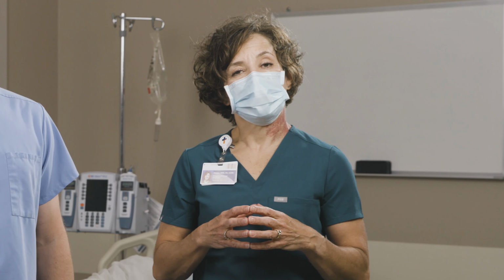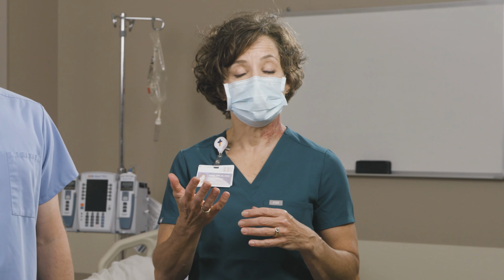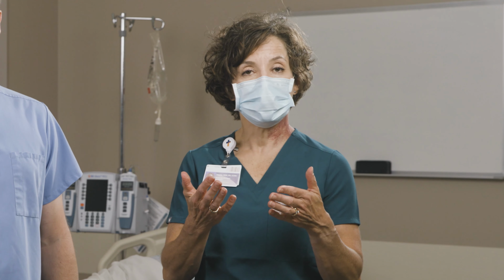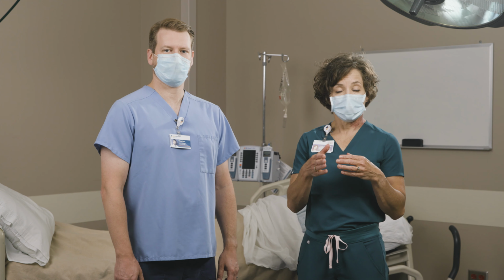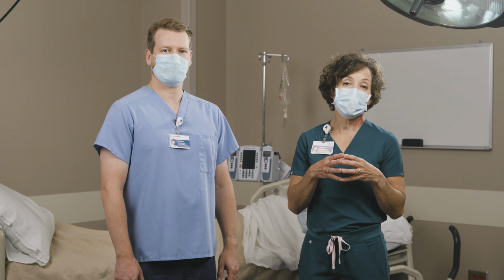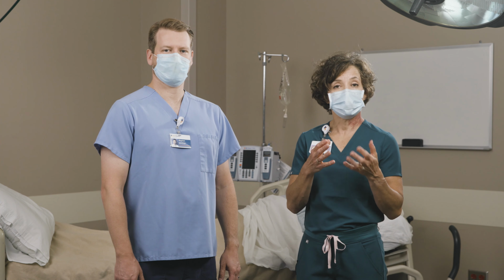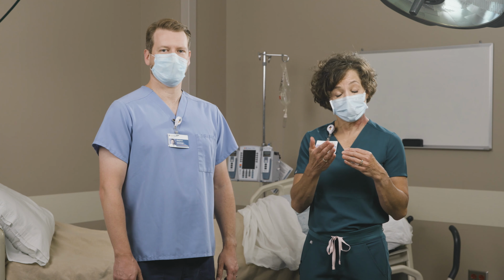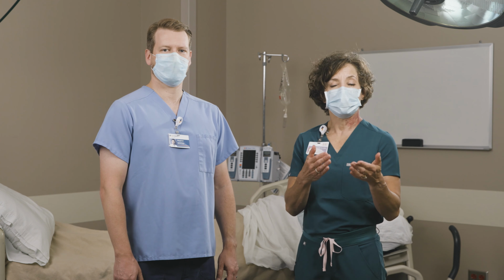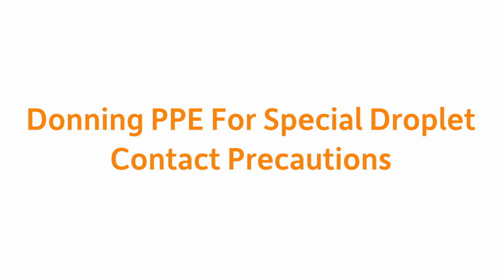As we continue our response to this COVID pandemic, and we anticipate the influenza season upon us with fall and winter coming, we wanted to provide a refresher training for you for donning and doffing two different specific PPE ensembles for COVID, go over some conservation and disinfection techniques of PPE so that you can continue to provide safe care, keep yourselves safe, and also be good stewards of the PPE that we have.